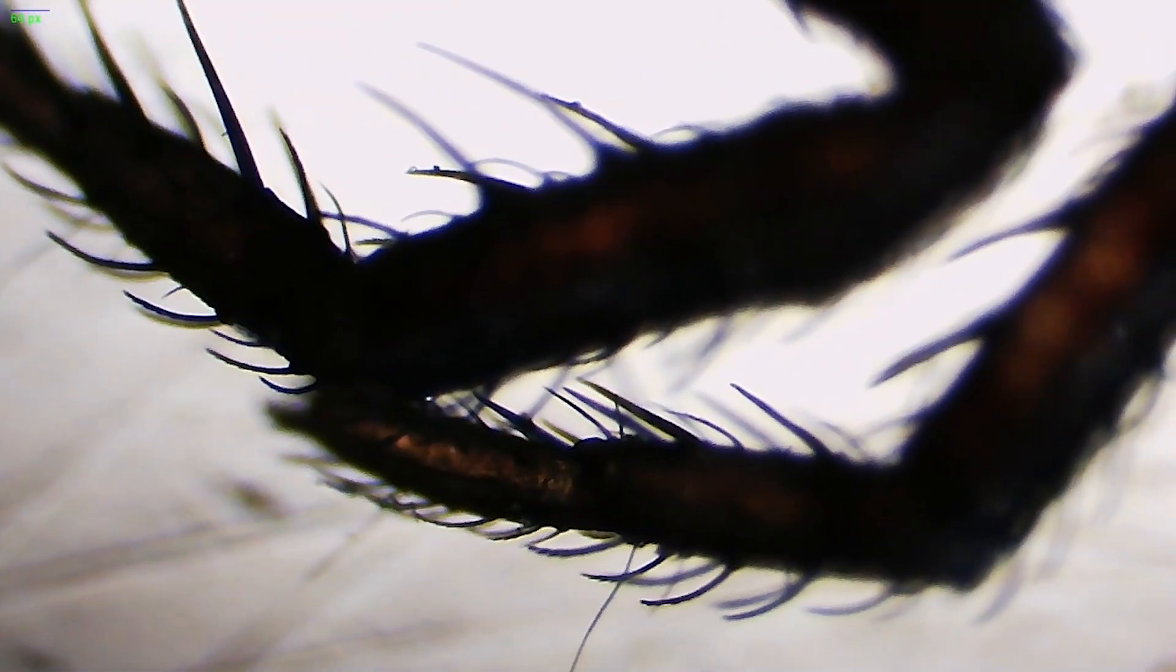And we have very big front legs. Oh, there he goes. Now a lot of people wonder how I get these guys to hold still. For many insects or bugs or animals or whatever we look at, they often actually will hold still on their own.